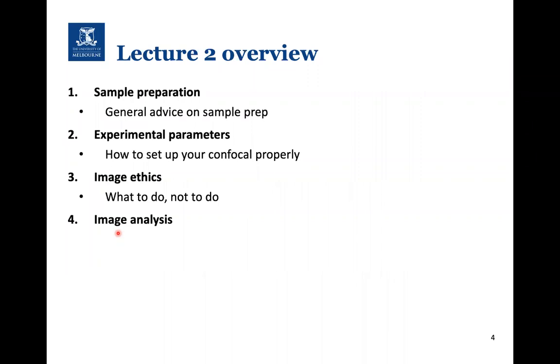Okay, so the overview of what we're covering today is we're going to go through some very general advice on sample preparation, how to prepare your samples for performing the imaging. We'll then go through some experimental parameters, and this is focused wholly around confocal imaging in terms of what your settings are and things to consider when you're setting up your confocal to do an experiment.